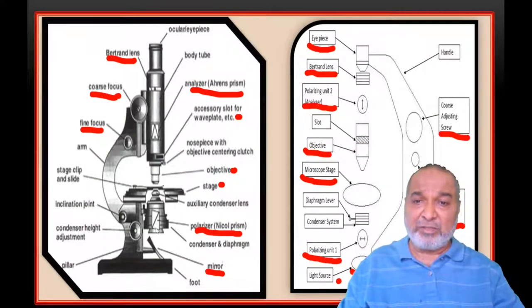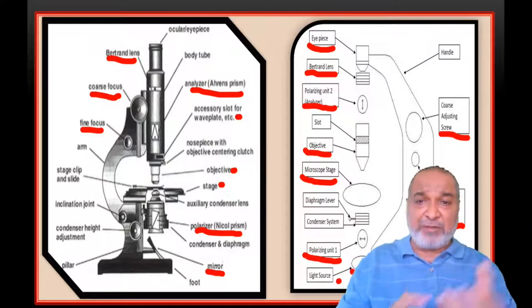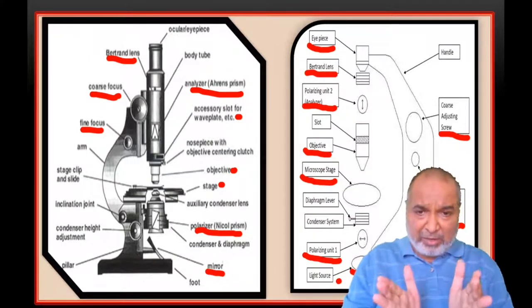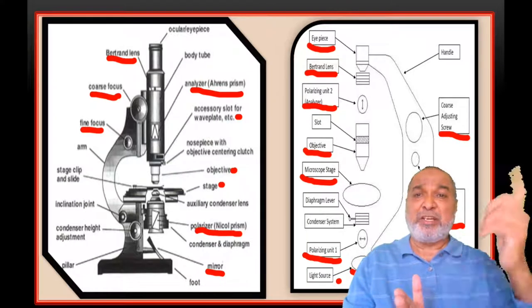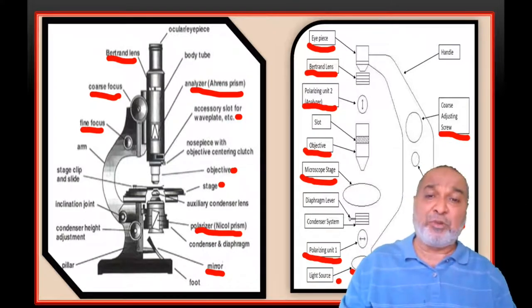along the optic axis. This is what is called the optic axis. Through that optic axis the maximum light has to be transferred, whatever sunlight is incident, it has to be reflected back. We have to make such a position of the microscope and the mirror that the maximum light is transmitted through the optic axis. So that is the basic use of the mirror.